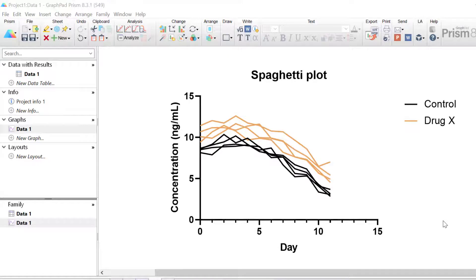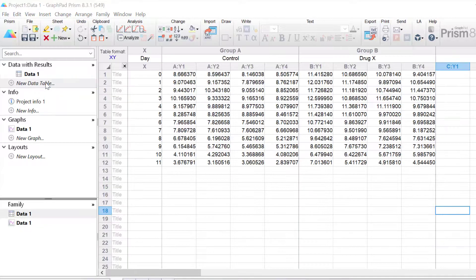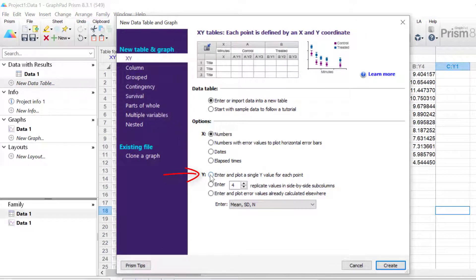To achieve this I need to create a new XY datasheet, but this time have the data entered so that each Y value is a separate point and not a replicate. So I'm going to click on the new data table option in the left hand window, and this time my Y values I'm going to enter and plot a single Y value for each point, then click the create button.